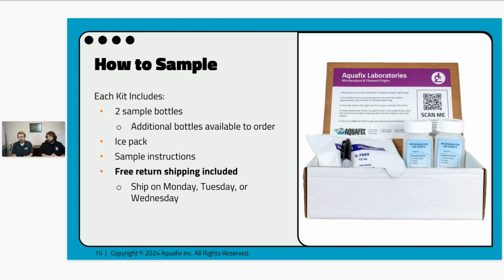Mixed liquor being we want to identify what's going on in the system. The foam being something where we ask: are there filaments? Is there something we can look at in the foam to give us an idea, beyond just the mixed liquor? Because a lot of the times, if it's a foaming or a bulking filament, sometimes that will lift up and it really gives us a good idea.